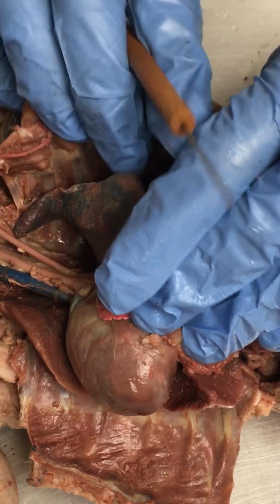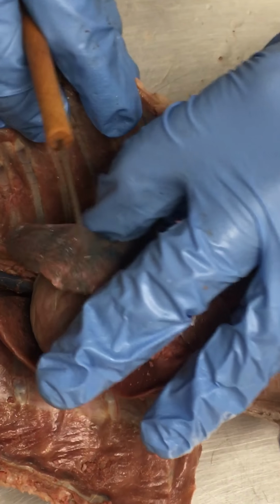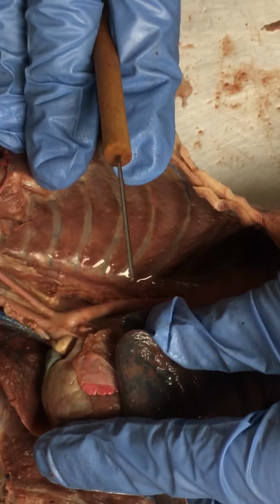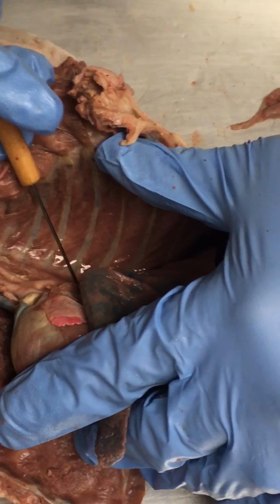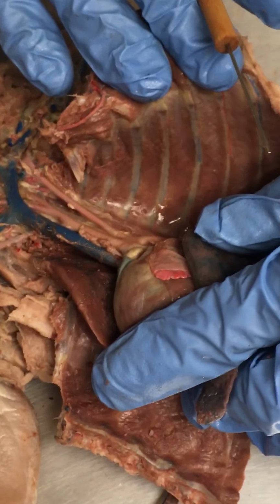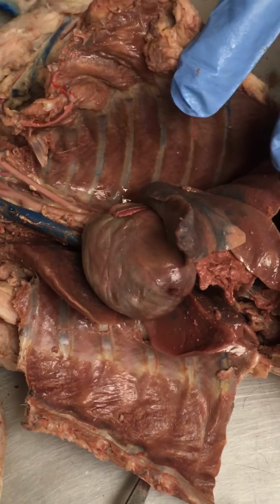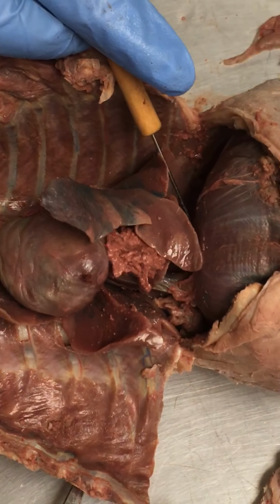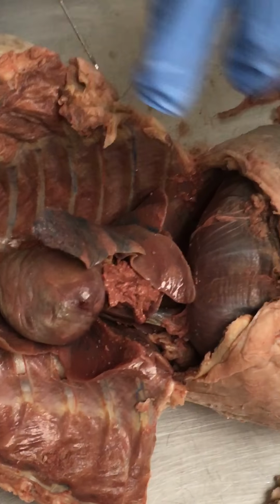It's just a continuation. And again, it'll be hard for you guys to see. My hands are all in the way, but you can see that aorta just continues on down and heads towards the diaphragm. So down in that region, that's the thoracic aorta. I also have abdominal aorta on here. That was my mistake. I should have put it on the next page. That's once the aorta goes through the diaphragm and comes out the other side. So we'll get him next lab period.